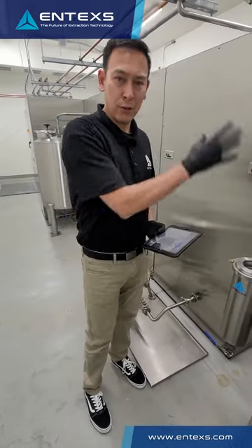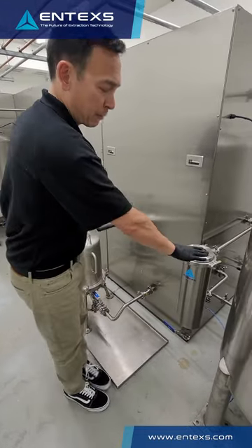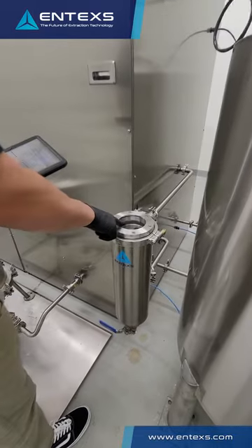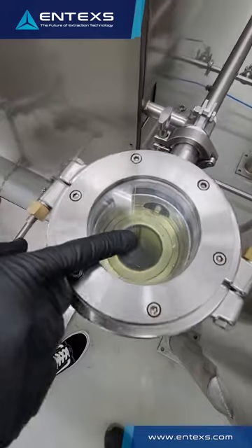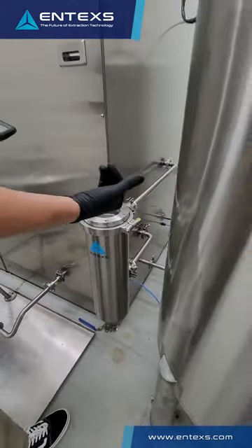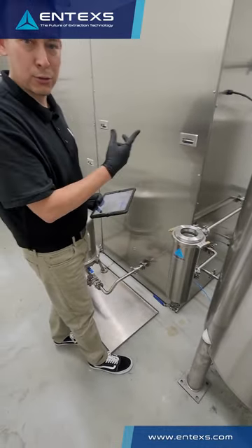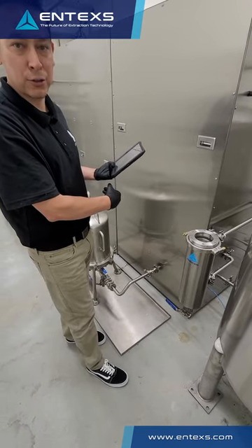When extraction is running through your bags of biomass in the extraction centrifuge, we have a pre-filter that allows you to look at product quality as it's coming out. What this does is capture any loose particulates. If you have a break in the bag or an issue with fines coming through the bag, this captures that, preventing those particulates from going through your pumping system and clogging your downstream fine filtration.